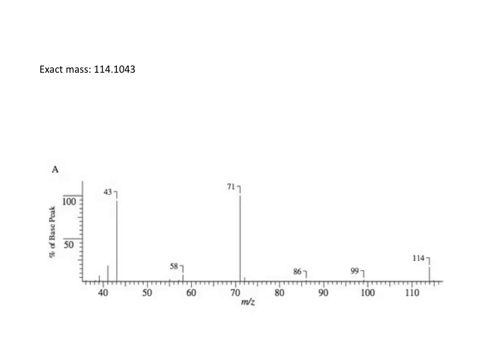This is a representative problem from the textbook in which I've combined data for the exact mass with the electron impact mass spectrum. This, in fact, is how you will typically see data presented. First of all, let's look at the molecular ion peak, which is an even number.